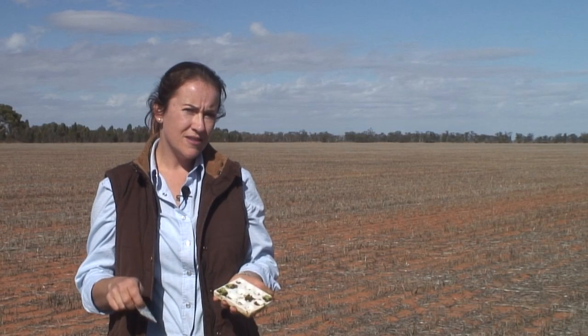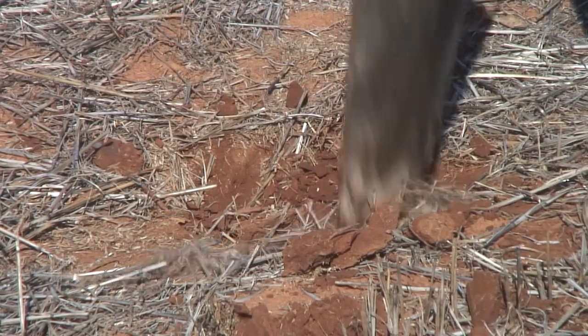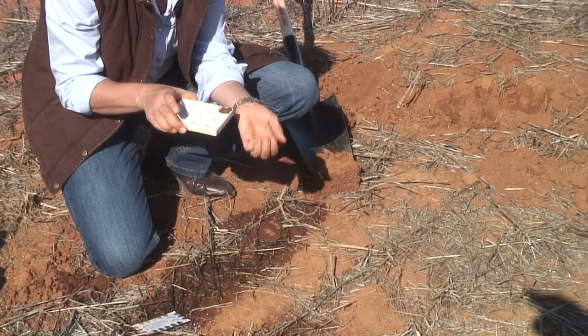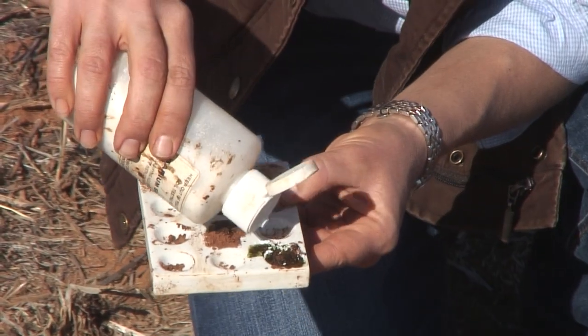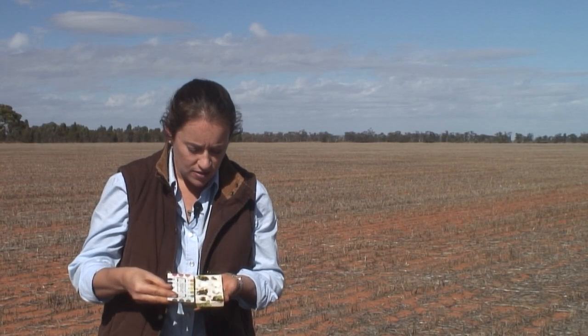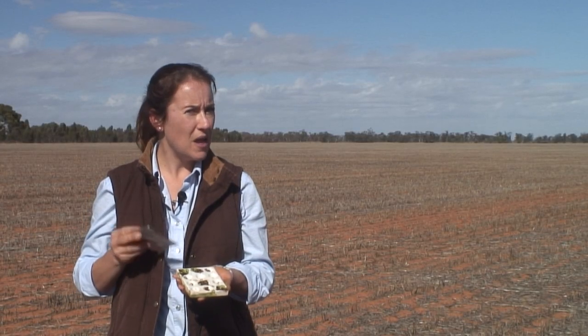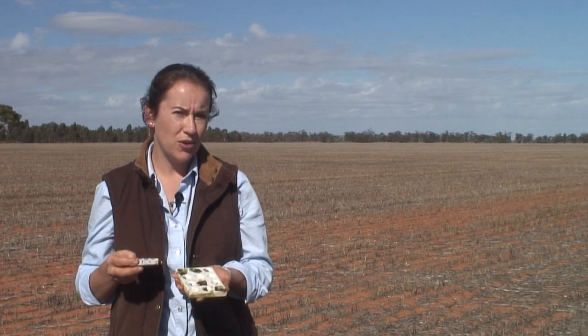In summary, to test for your soil pH: grab a sample of your soil and do it a couple of times to be sure. Put it on a white plate or something white that will show the indicator changing. Add your reagent, then your powder, and use the simple colour card to identify your soil pH. From there you know what you're managing pH-wise, and you can speak to your local agronomist or natural resource officer to help manage any pH issues you may have.